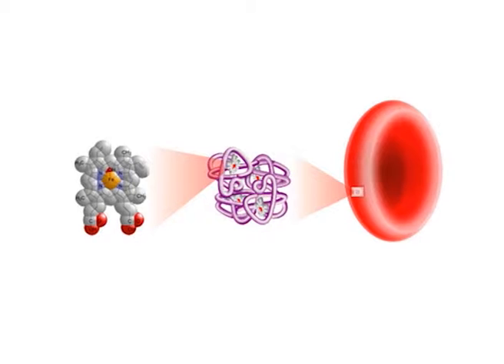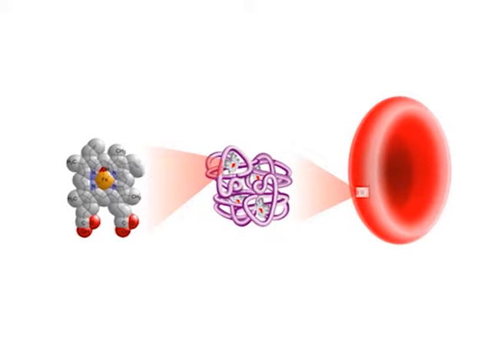Now, how is this solution prepared? A buffer solution containing 10% by weight of sodium acetate and 80% by volume of glacial acetic acid is prepared. To 100 ml of this solution, 2 grams of 3,3',5,5'-tetramethylbenzidine reagent is added.